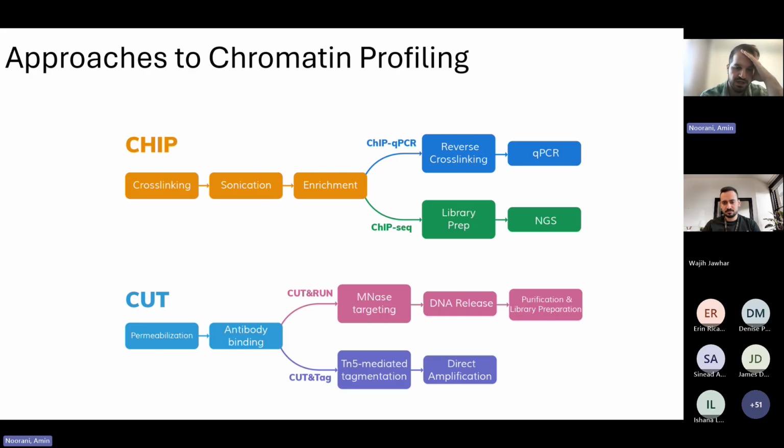On the other hand, there are CUT&RUN and CUT&TAG methods, which are newer and give you cleaner results.